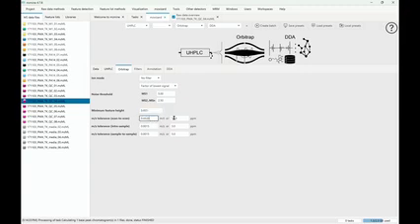And then these tolerances, we're just going to leave with the default. Now you would say 10 ppm for Orbitrap is much too high, but this is actually the tolerance scan to scan. If we want to find the different signals from the first scan to the last scan and build a chromatogram, we have to be a bit wider. And within that tolerance, usually there are also not many things that are going to interfere. So we just leave it to the default.